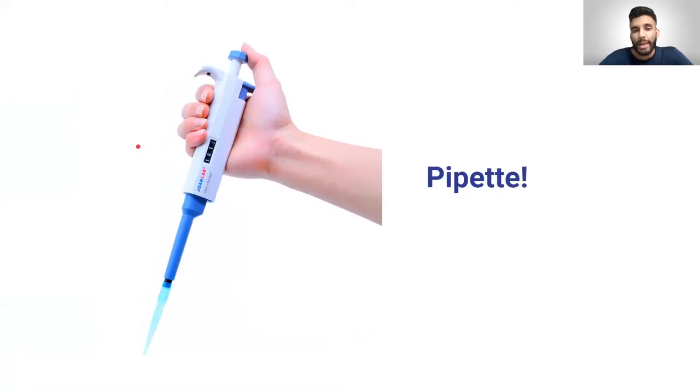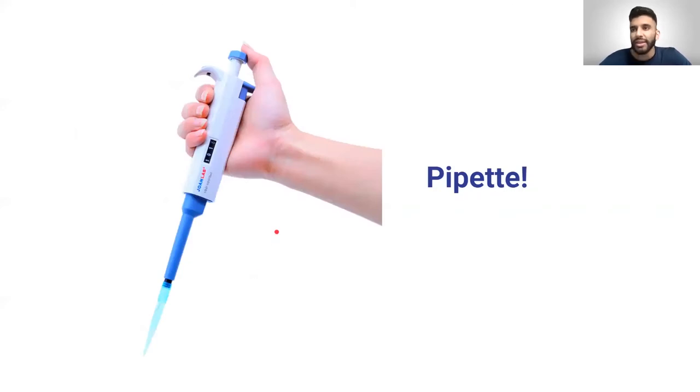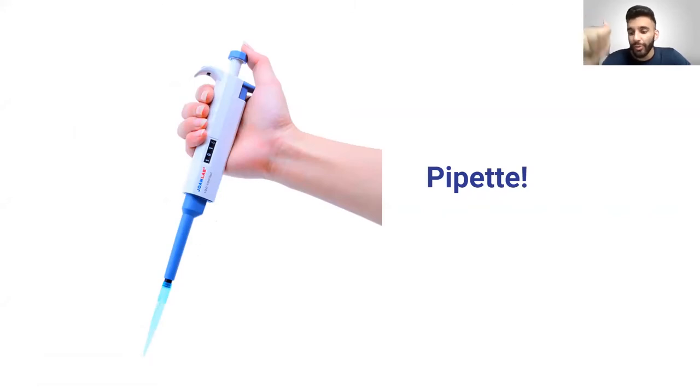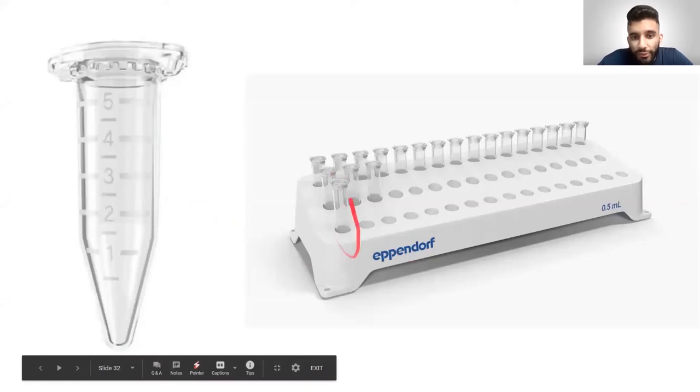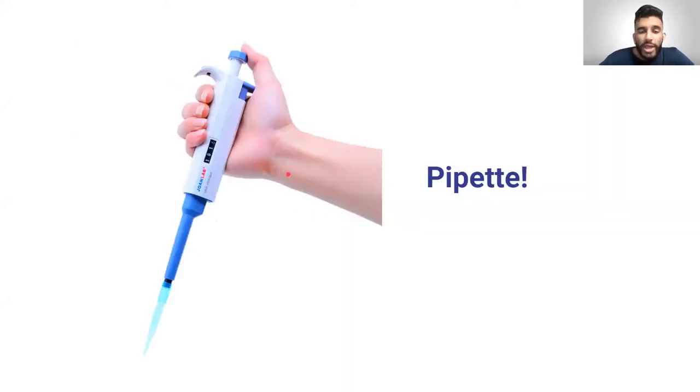You use a pipette to transfer things like DNA and liquids from one tube to another. A pipette is basically like a very advanced straw — all it does is suck up some fluid, store that fluid, and then inject it where you want it. If I wanted to take DNA from one epitube and put it in another, I'd stick the pipette into the epitube, absorb the liquid, and transfer it to the other tube. This is the right way to hold it.